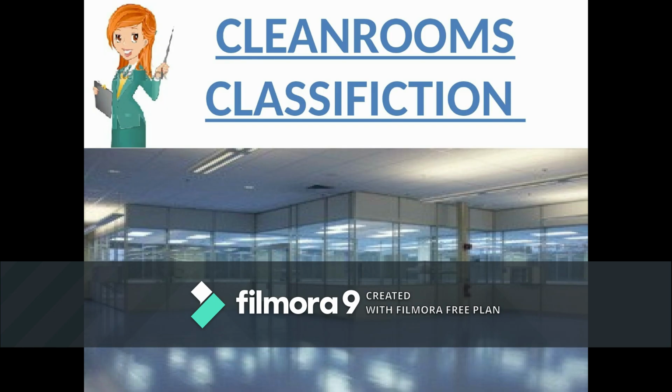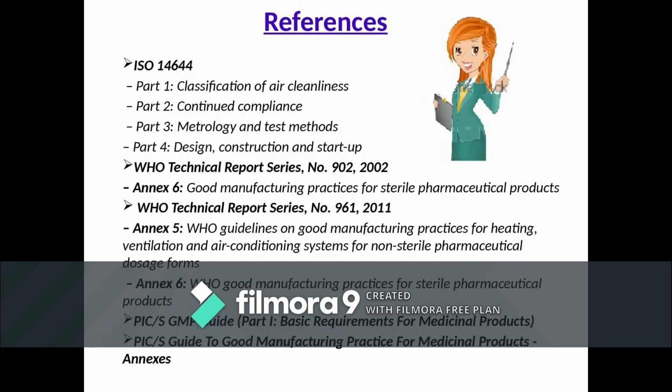So here is our today's topic. It is clean room classification. Basically, this is relevant to our previous session, which was HVAC, and under NVPC, the non-viable particle count test of HVAC, this comes there, right? So here is the reference of clean room classification.